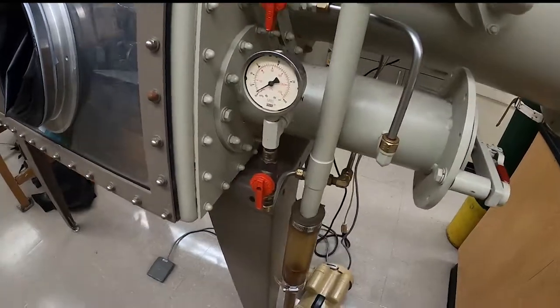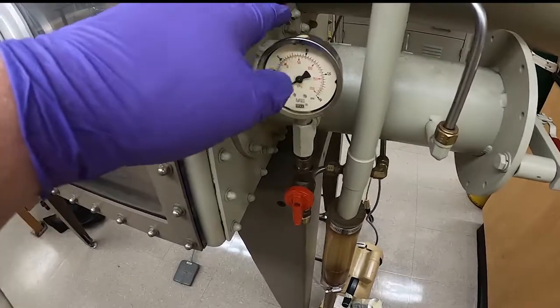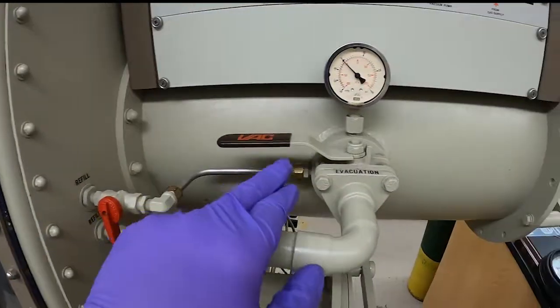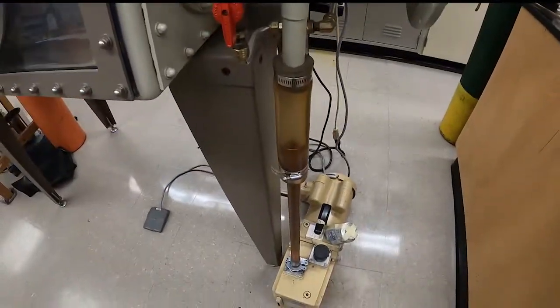There are the valves for those. This is the valve that evacuates the small antechamber. Here's the refill valve for the small antechamber, the refill valve for the large antechamber, and the evacuation valve — the vac valve to the vacuum pump. You can see this tube and follow it to the vacuum pump.